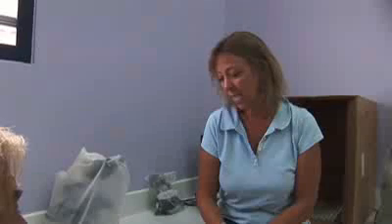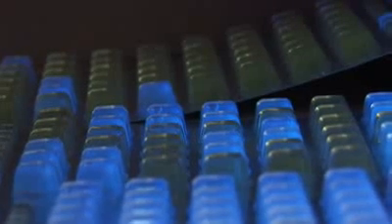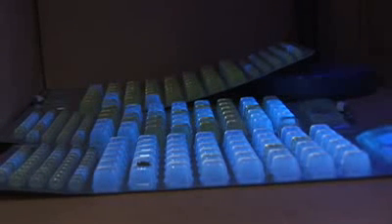So the results of the test are shown when we put a black light on the panels that were filled with the water. And what we have in this white box, our cardboard light box, are the samples. This is a day after the analysis. So at 3 o'clock yesterday, we took these out and did the counts. Anywhere you see fluorescence, that means that there are enterococci bacteria present.